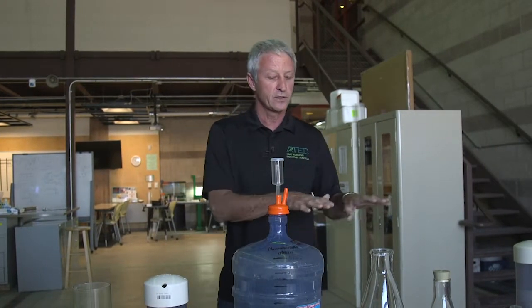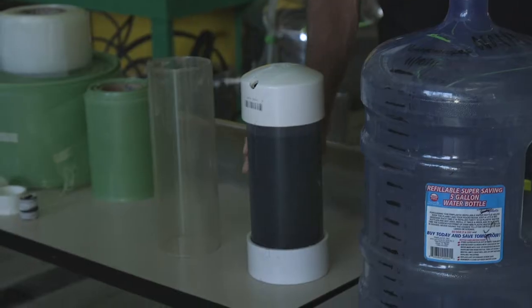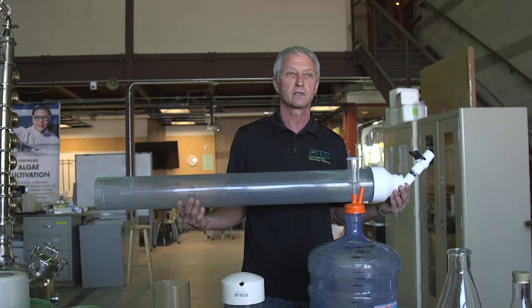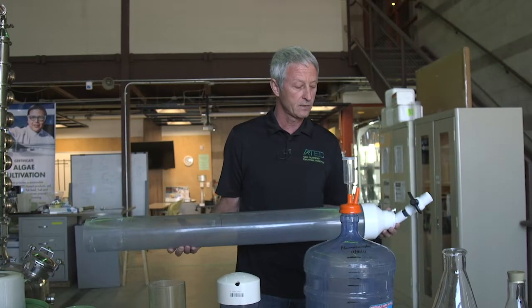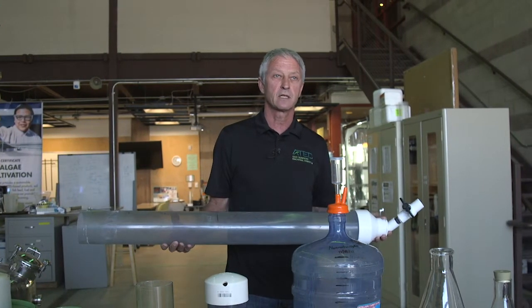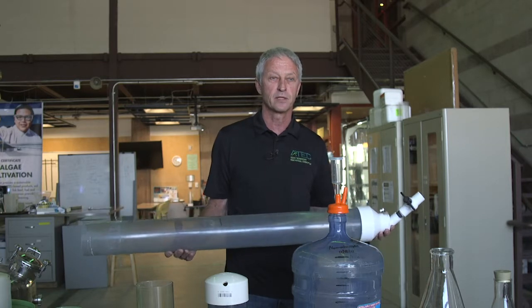Another alternative is scaling from here to something like this. We use a company called New Solutions Energy that provides our reactor systems here that they're developing. The advantage of this material for us — with students — is it's a full drain system, it's easy to clean, they can assemble it, and they can manufacture them here.